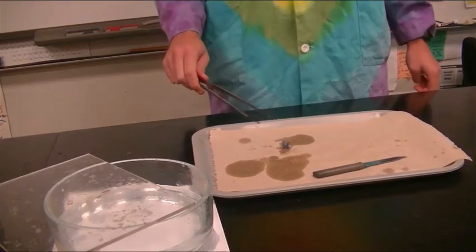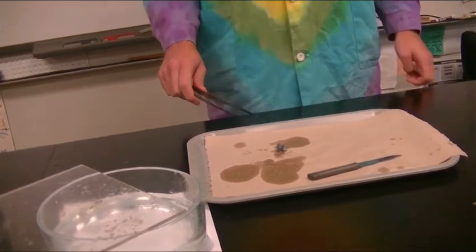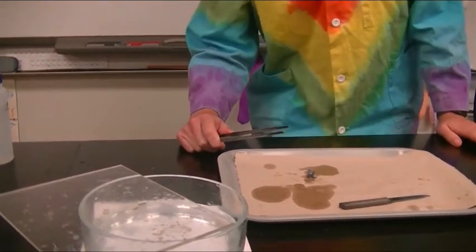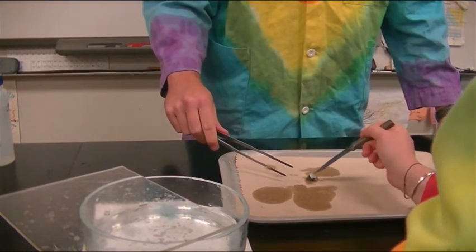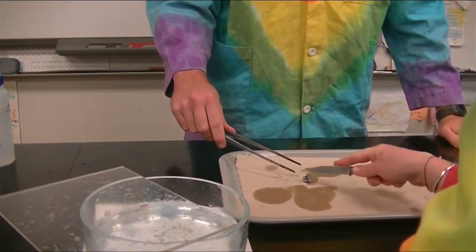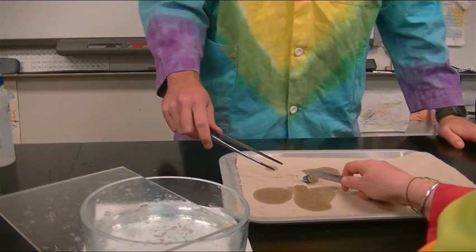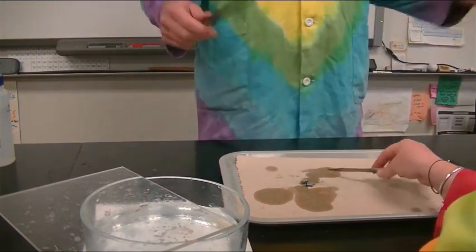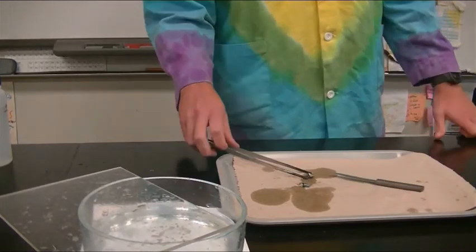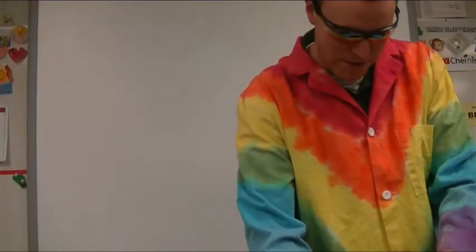This is how much I did last time. No, that's not true. Are you crazy? That is so big. That's too big. Are you crazy? That's how much I'm doing this time. Look at the flash shield. Okay, so last time you weren't there, and now all of a sudden mom shows up. Put it back. Try it again. Oh my gosh.